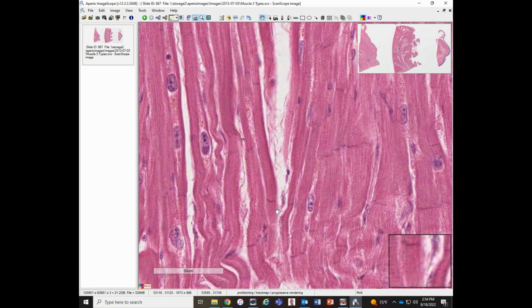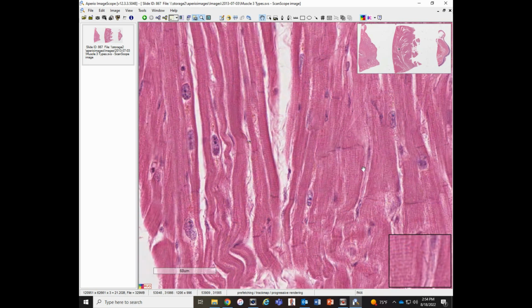But one thing cardiac muscle has that skeletal muscle doesn't are these dense areas here that mark where these cells fuse. Instead of nerves innervating every fiber, the contraction and depolarization of cardiac muscle passes from cell to cell. And in these dense areas, these cells are fused together, and a little less visibly along here we have gap junctions that allow cytoplasm to be shared between these cells so that a contraction or action potential can actually be passed from one cell to its neighbors.